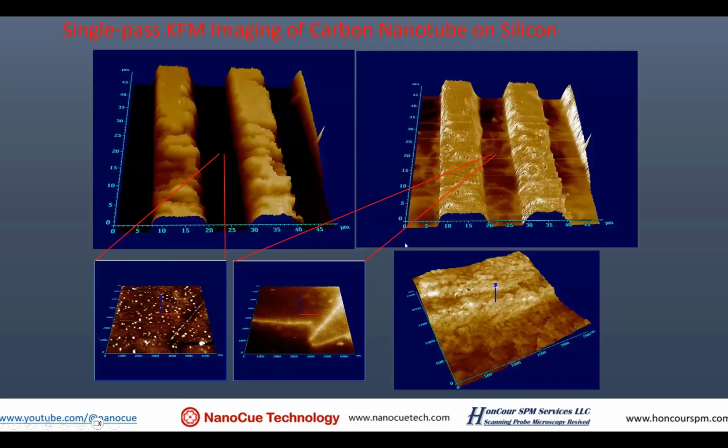Song, I have a quick question regarding the KFM. And it's actually very basic, I guess. What's the ideal substrate for using the KFM? Because I'm just assuming that it has to be semiconducting.